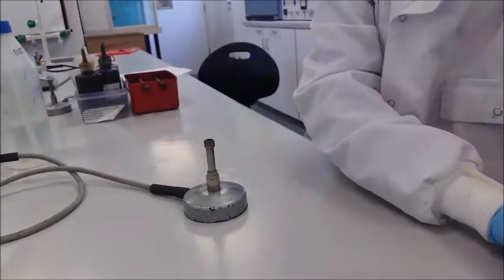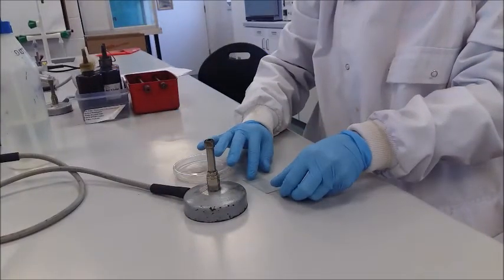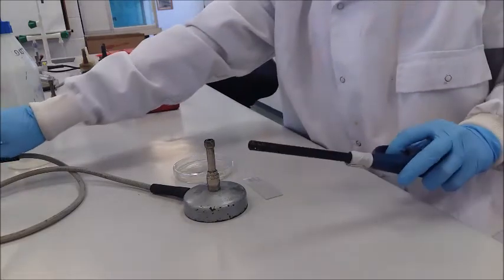To begin, we must first prepare a smear slide. Take a clean slide and place it near the flame. Sterilize the wire loop in the flame.